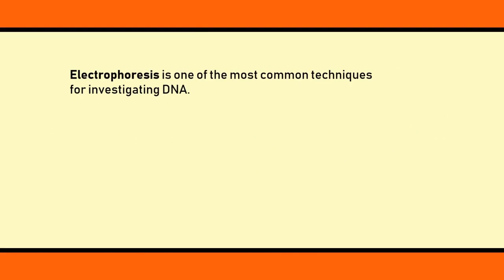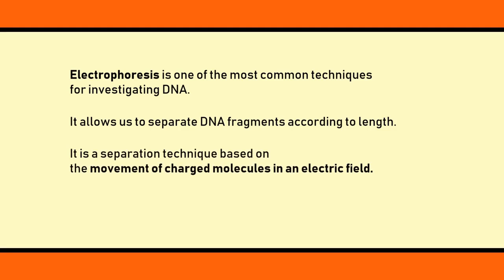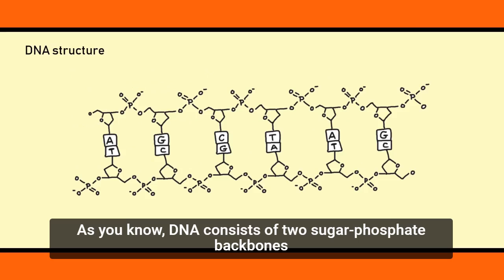Electrophoresis is one of the most common techniques for investigating DNA. It allows us to separate DNA fragments according to length. It is a separation technique based on the movement of charged molecules in an electric field.